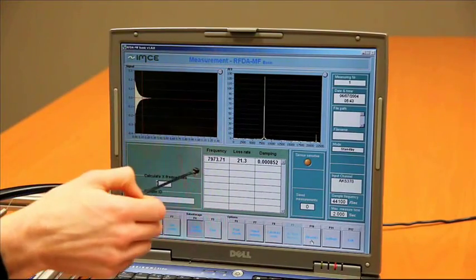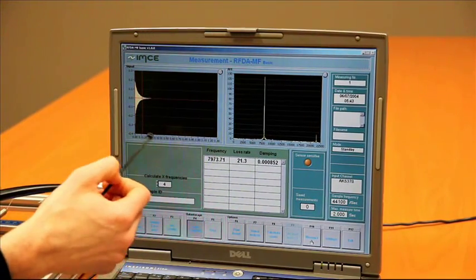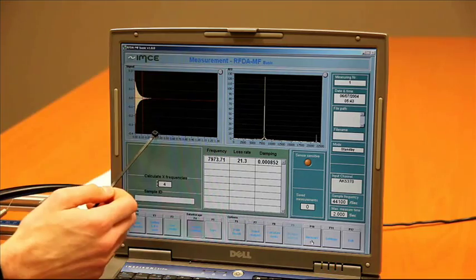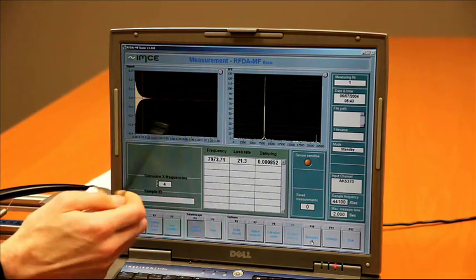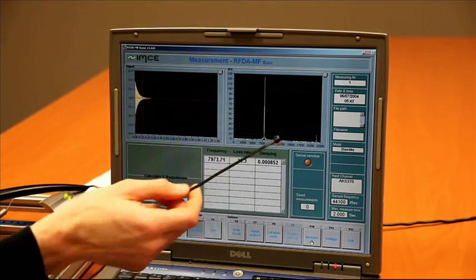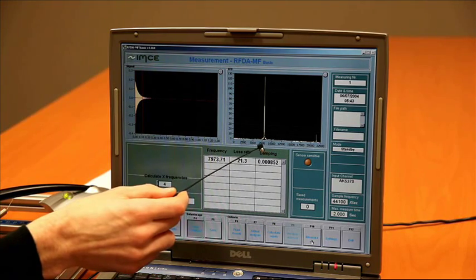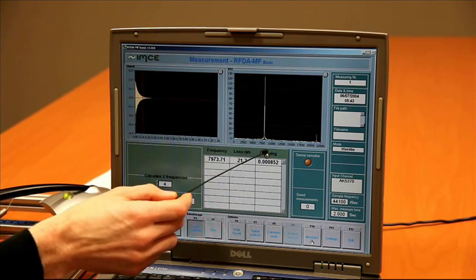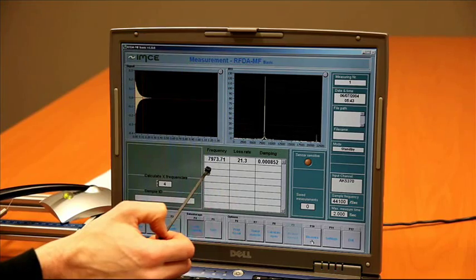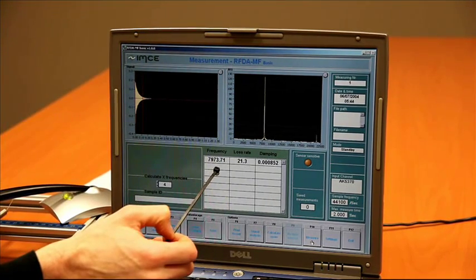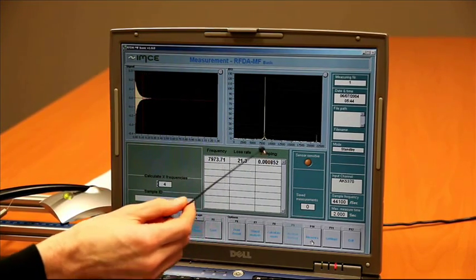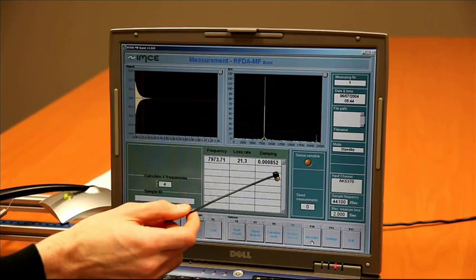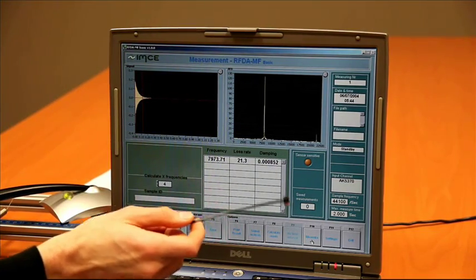In these two screens, in the first screen we see the vibration signal that we recorded using the microphone. In the second screen we see the frequency spectrum with one large peak at around 7900 Hz. This is the flexural vibration, and we see the internal friction.